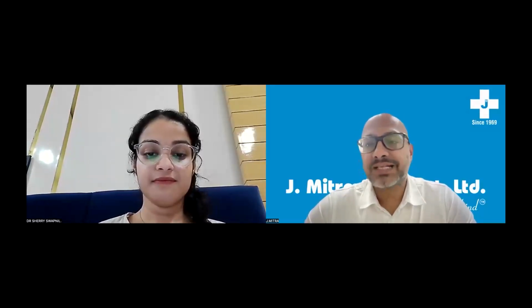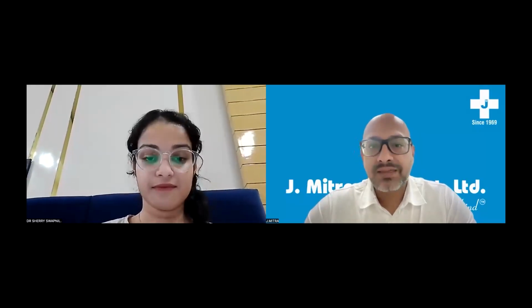Cervical cancer continues to be one of the leading causes of cancer-related mortality among women in India today. And yet, it remains amongst the most preventable of cancers. The difference between an advanced diagnosis and a curable lesion very often comes down to the quality of screening: how the sample is collected, how it is fixed and stained, and how carefully it is interpreted and reported. Despite the availability of newer technologies, the conventional pap smear remains the backbone of cervical cancer screening in most of our laboratories, which makes getting the fundamentals right more important than ever.